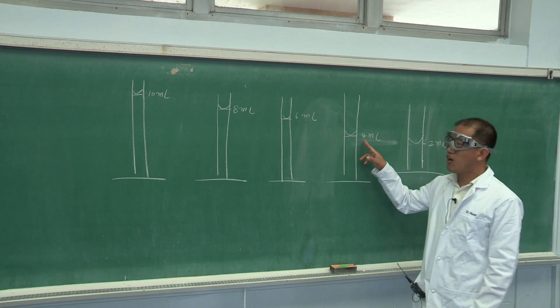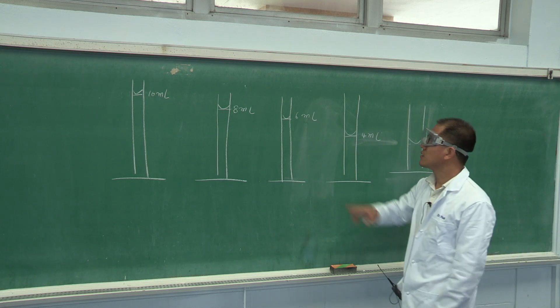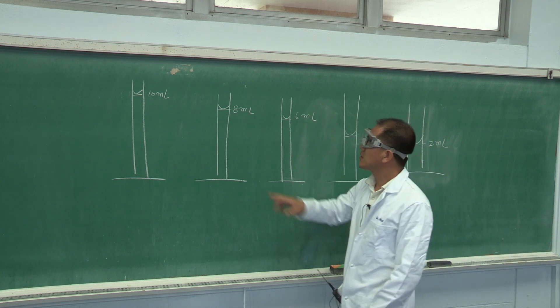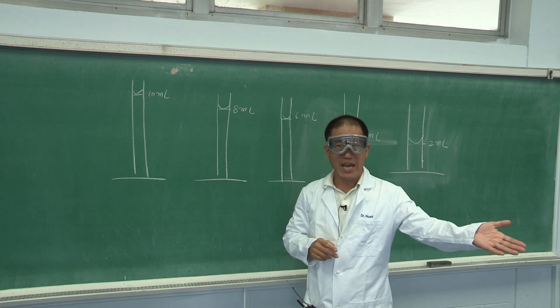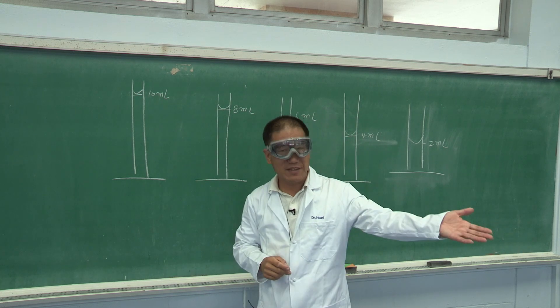Next, we will add more water to 4 milliliter mark, get the mass. Add to 6 milliliter mark, get the mass. Add to 8 milliliter mark, get the mass. Then, finally, 10 milliliter mark, get the mass.